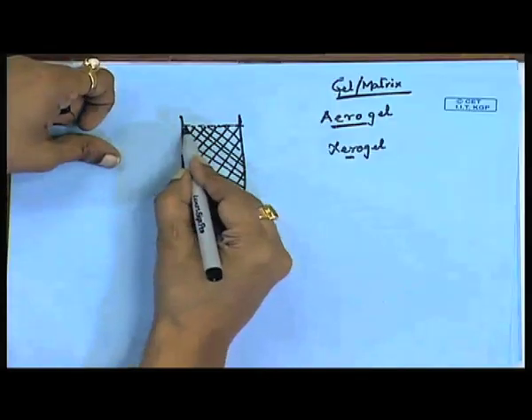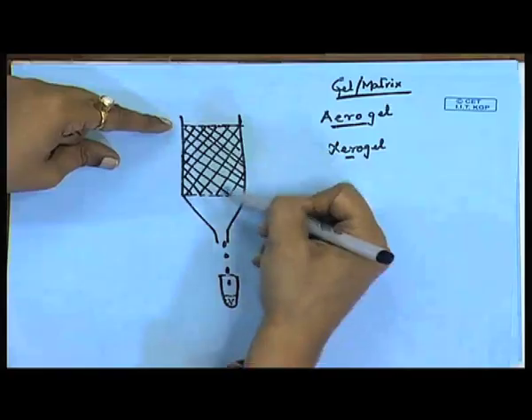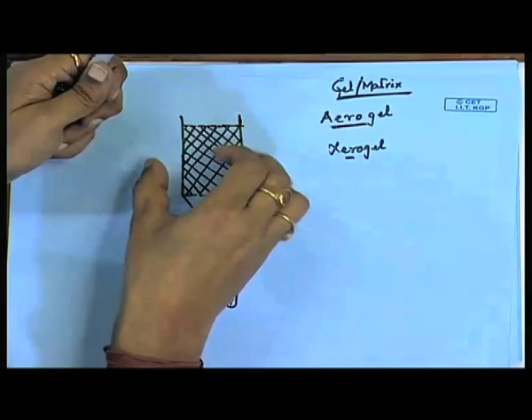When we get this xerogel, it is in powder form, and before packing it inside the column we have to swell it. After appropriate swelling, we pack the gel into the column. Once packed, there should not be any swelling or shrinkage during the separation of biological macromolecules.